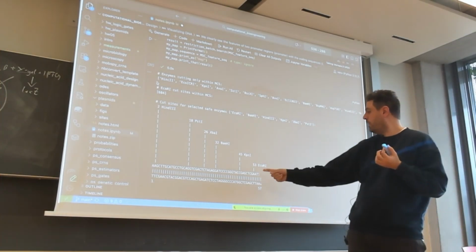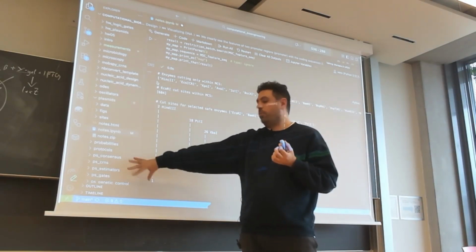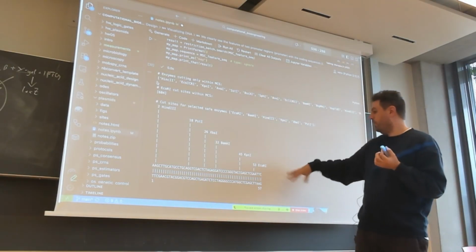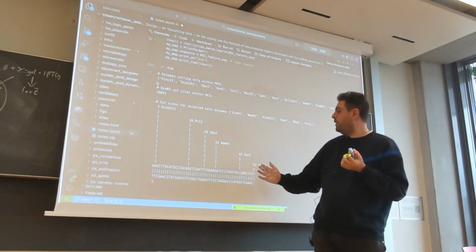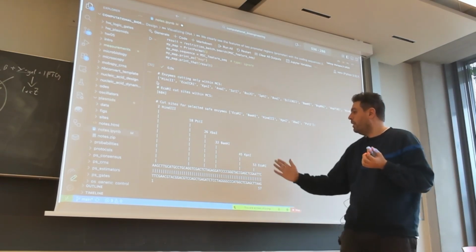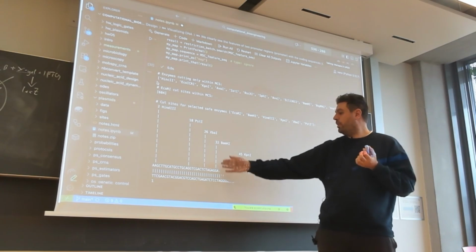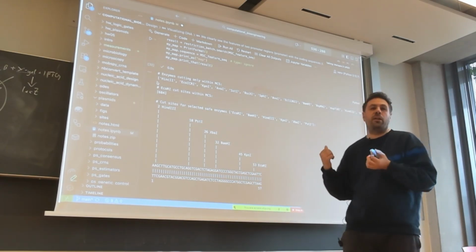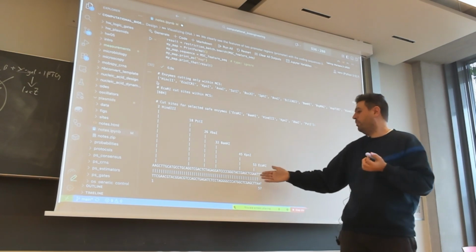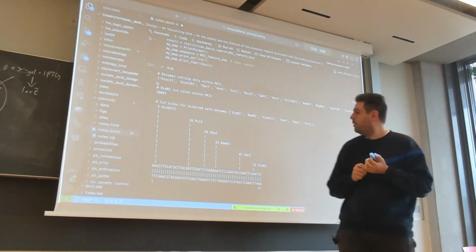We can see this small reason already here. You can imagine here is your promoter, and here is the coding sequence we are going to insert. The only reason I chose BamHI is that it's a little bit closer to the promoter. Whatever we insert here, and this will be the ribosome binding site, we want to be a little bit closer to the promoter, but it's totally fine to do that here also.